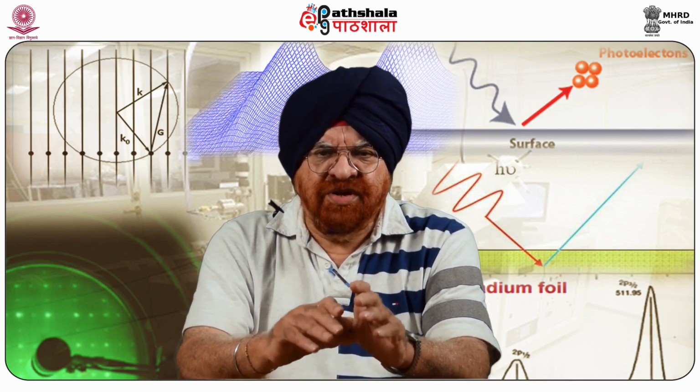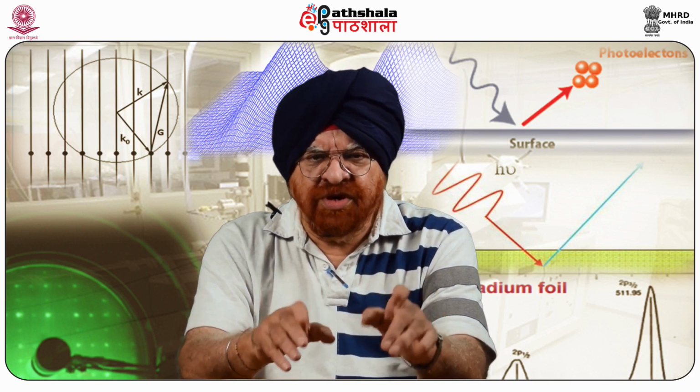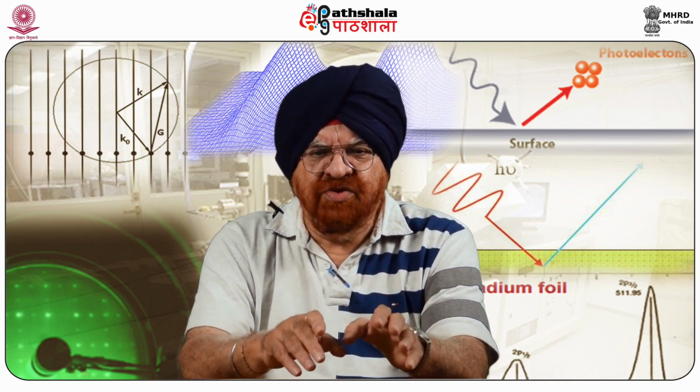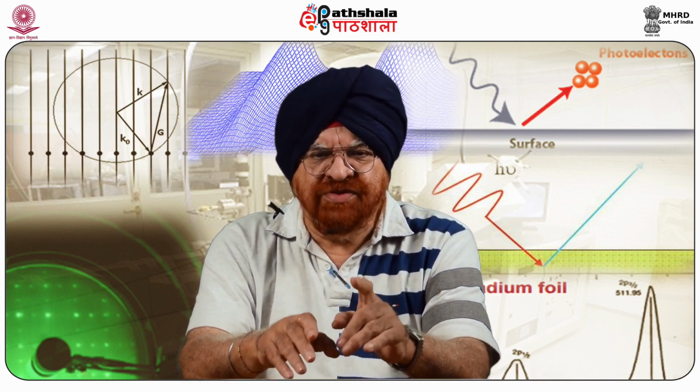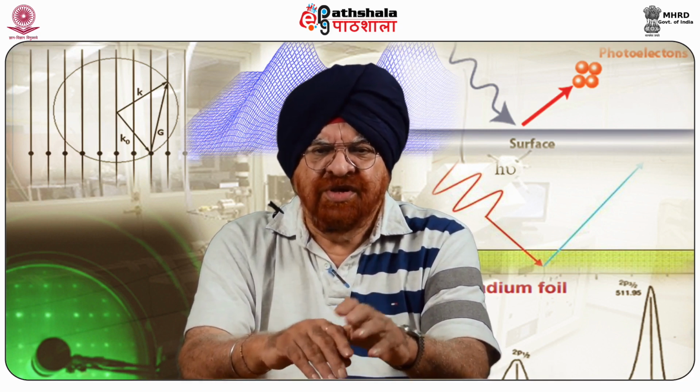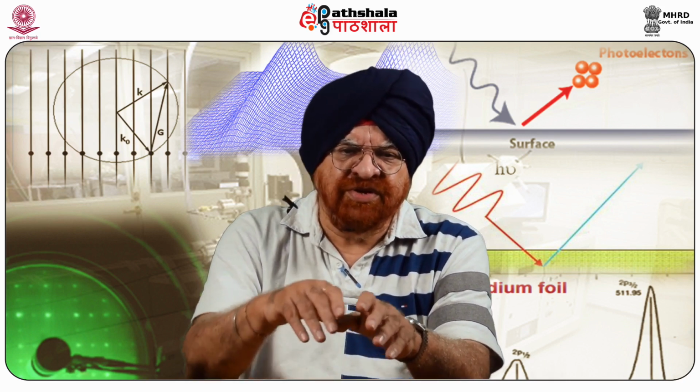The amplitude of oscillation increases as the tip sample distance increases. This is an important condition: as the amplitude of oscillation increases, the tip sample distance also increases. This happens due to the decrease of the tip sample interaction.